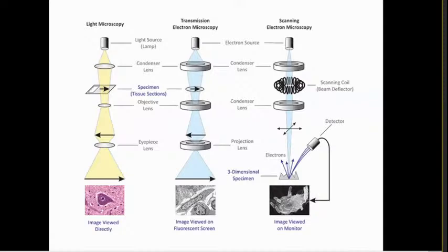In electron microscopy, we can analyze the internal part. If you are doing a histopathological study, meaning the accumulation of compounds, metals, or ions, we can predict it through transmission electron microscopy. In the SEM, we can find only the shape, of a three-dimensional specimen. In the SEM we use two condenser lenses. There is no objective lens. The main important thing about the SEM is that we use two condenser lenses and there is no objective lens.